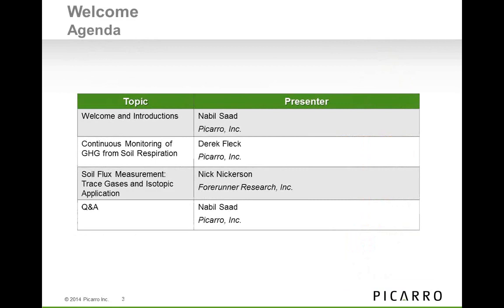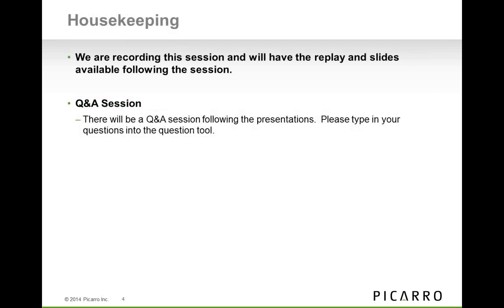The agenda for today would be that we start with Derek Fleck with his presentation about continuous monitoring of greenhouse gases from soil respiration and the comparison with GC. And then we'll be followed by Nick Nickerson's presentation about trace gases, soil flux measurement, trace gases, and isotopic applications. Right after the presentation of Nick, we'll open the floor for Q&A, and in the meantime, keep typing in your questions, and then we'll compile them, and during the Q&A session, we start addressing them one by one.